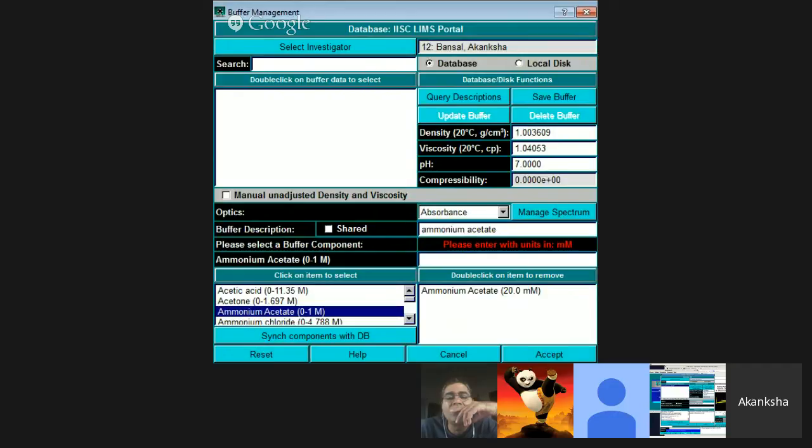And if I go in and make another one here, let's say a TE buffer, it adds it just fine.